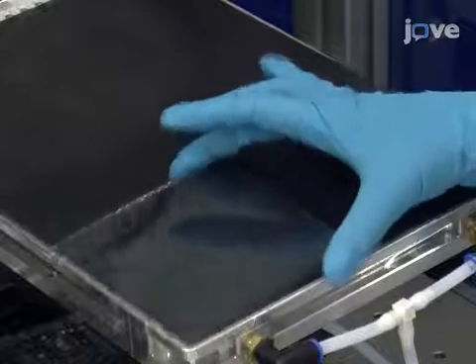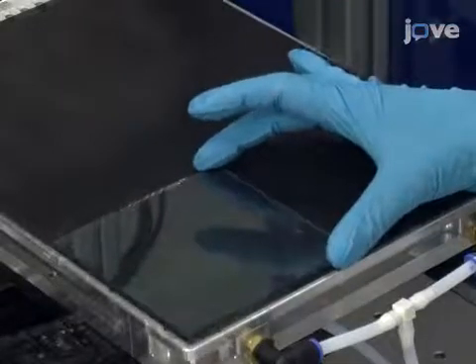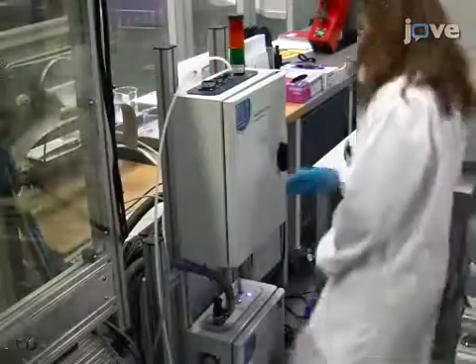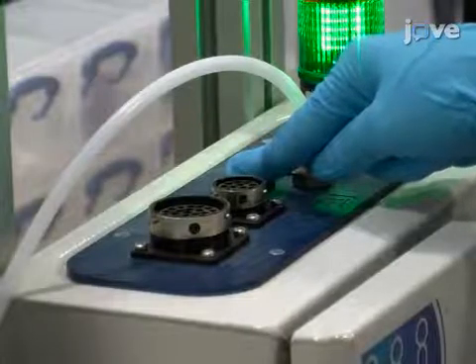Follow this by loading the glass substrate into the printer according to the manufacturer's instructions. Turn on the attached vacuum pump and purge the ink through the print nozzles by pressing the purge button located on the vacuum pump.